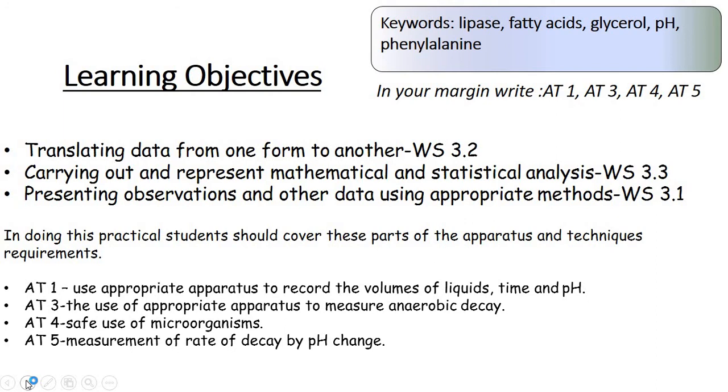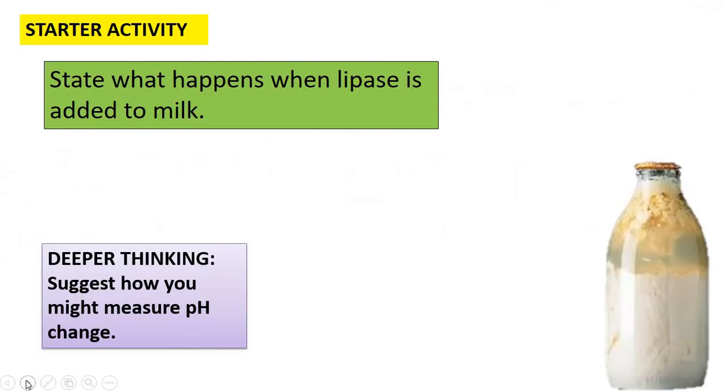A measurement of rate of decay by pH change, and there we go. So what we've got here was the starter activity to get you thinking about this practical in a bit more detail. State what happens when lipase is added to milk.